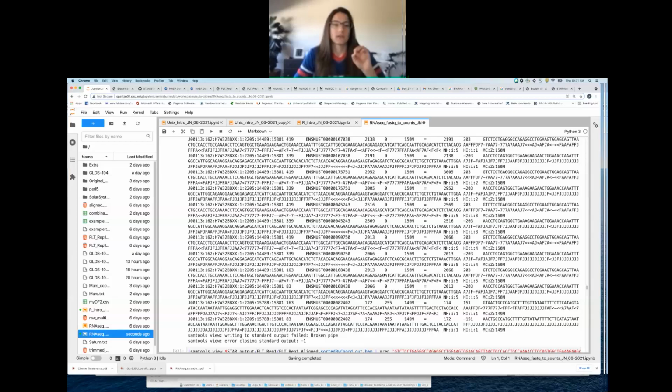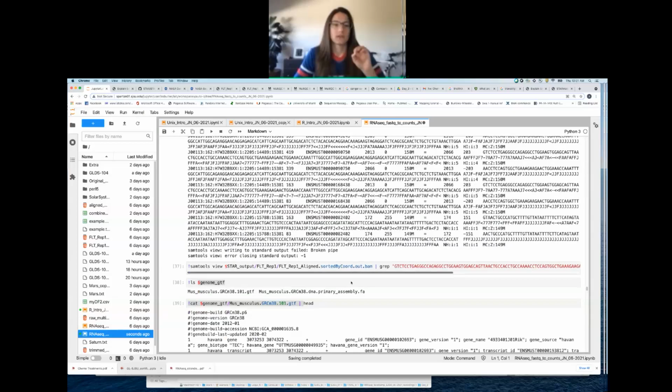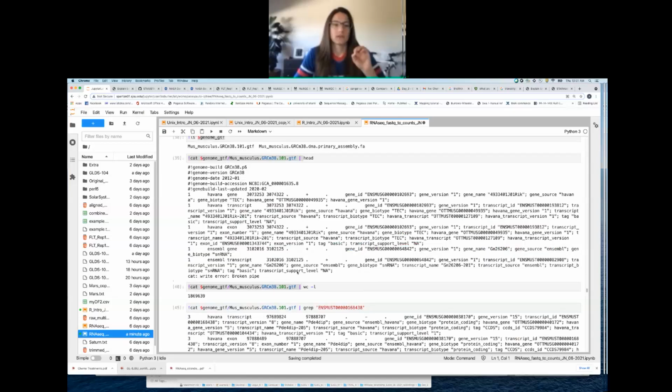Cool. You also got to learn some more Unix functions that are used pretty often in bioinformatics for doing exactly this sort of thing, right? For trying to figure out what's going on with your data, what's happening, where things are aligning to, and trying to make sense of it. So thank you for the question, Felix.